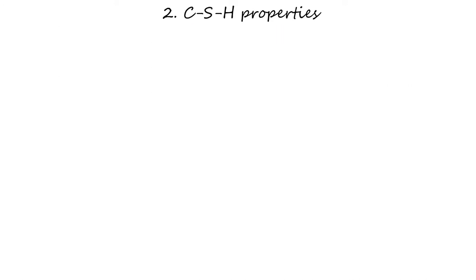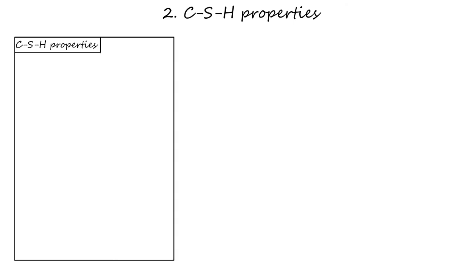In the video NMR-II analysis, it was shown how a system of mass, volume, and molar balances of the constituents of cement can be used to obtain further information from an NMR measurement. This analysis, as explained there, requires further input from XRD and chemical shrinkage measurements. The additional properties which can be derived are the CSH density, denoted ρx.